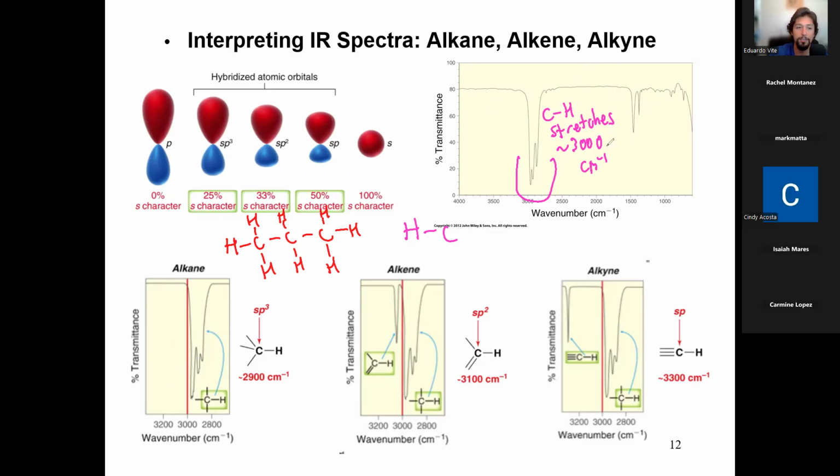Notice how the spectra looks pretty simple. There's not really many peaks. There's not really many things happening there, right? It's just maybe 2 or 3 peaks and that's it. So this tells me there's only really a carbon-hydrogen bond happening somewhere around there. And remember, triple bonds are stronger. So if you look down here where it says alkyne at the bottom right, you'll see this peak, this CH.